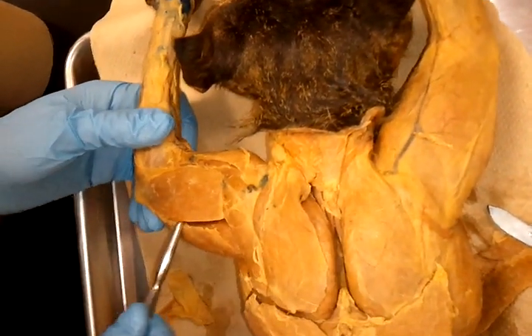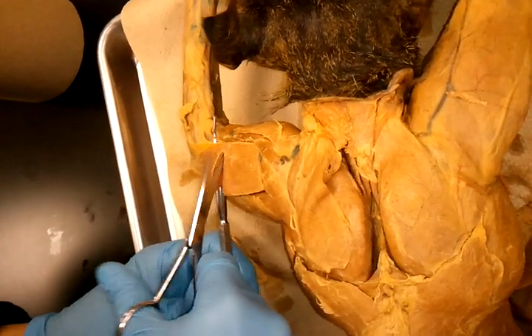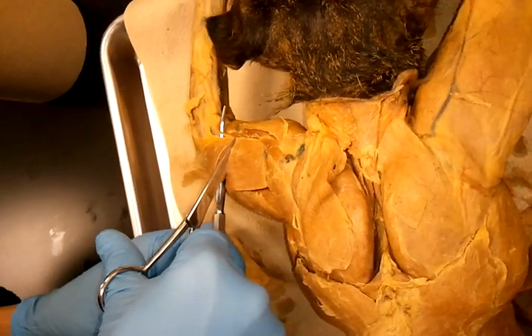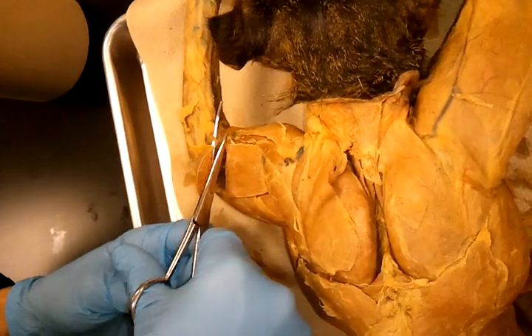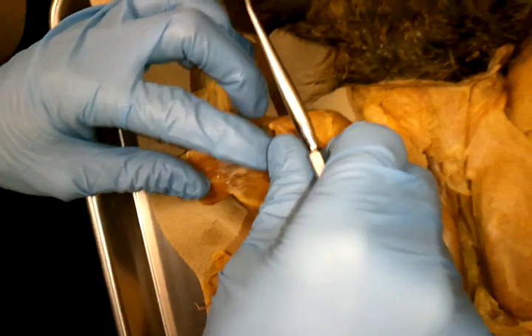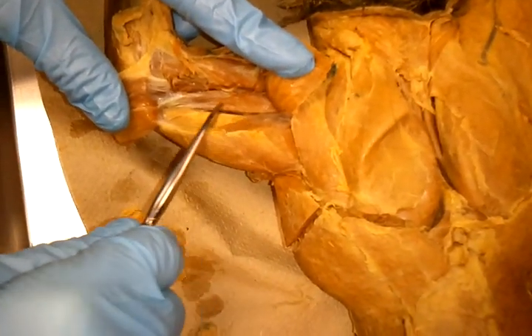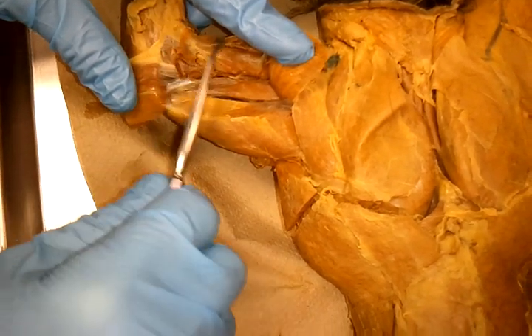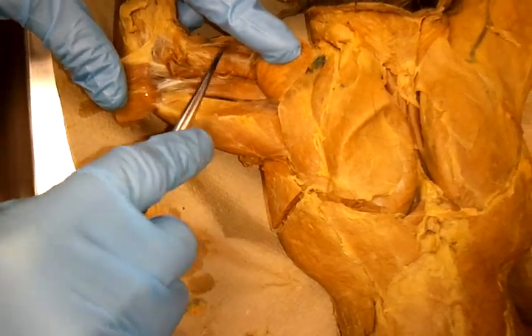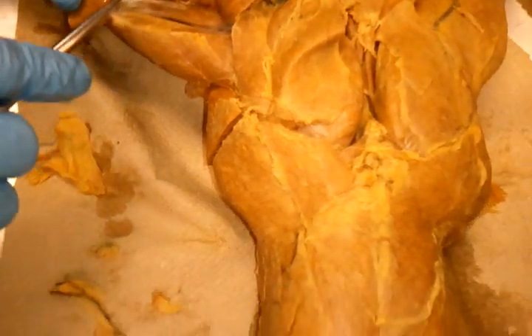So what we do, we separate this here — we reflect this muscle. And now in here we'll find triceps brachii medial head. And over this muscle here is your brachialis.